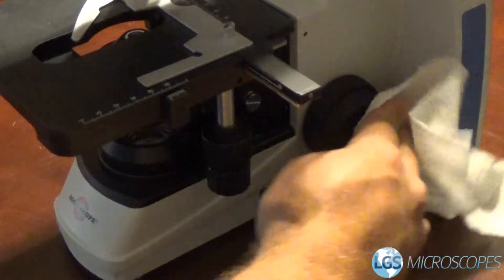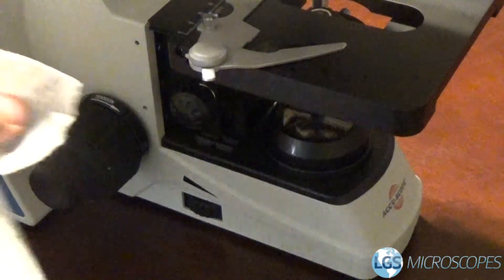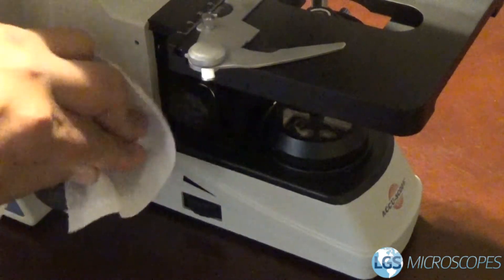So I'm going to go ahead and wipe off the focus knobs and the condenser carrier knob. And of course you want to get the aperture control down here too, because that's another thing that gets touched.